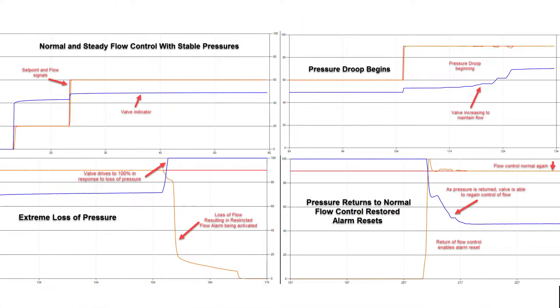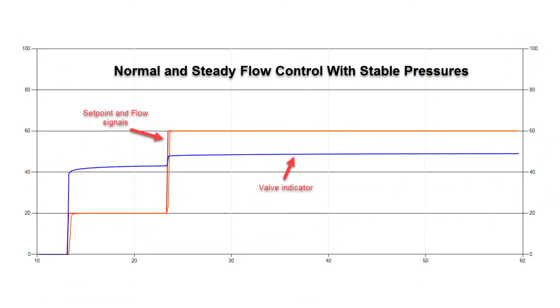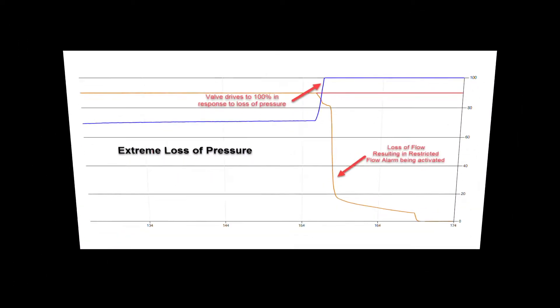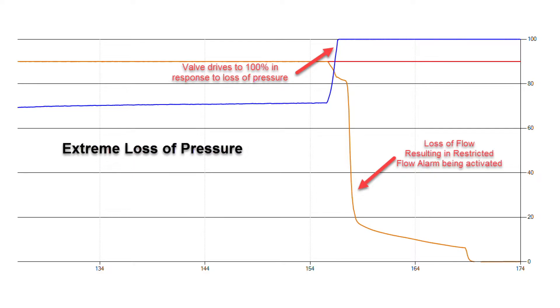I want to start by showing a few screenshots explaining how the restricted flow alarm works. As you can see, this shot shows a normally flowing mass flow controller — valve drive and flow are smooth and steady. As you begin to see a loss of inlet pressure or pressure droop, the valve automatically opens further to maintain the desired flow.